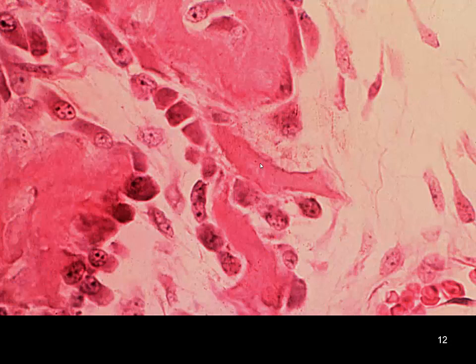So again, looking at a bit higher magnification, we got a nice osteoblastic cell here adjacent to the bone that's being laid down. Some bone lining cells here, more osteoblasts, and an osteocyte that's completely surrounded by this eosinophilic, this red bone matrix.